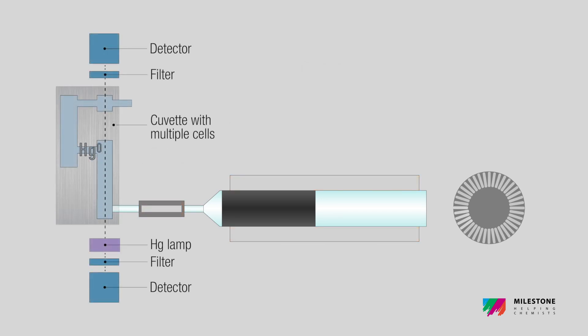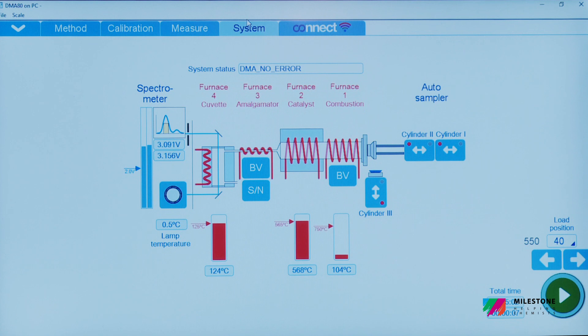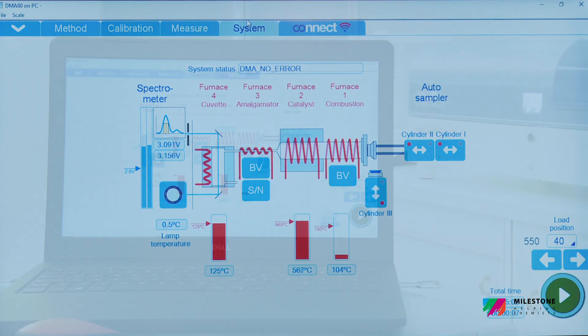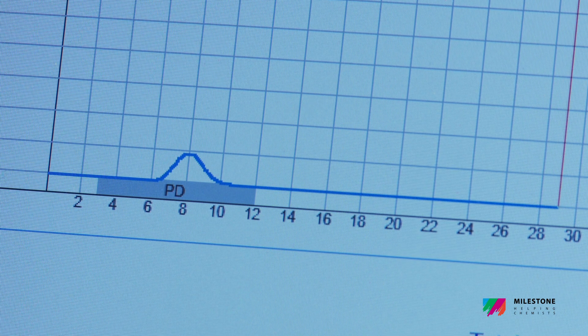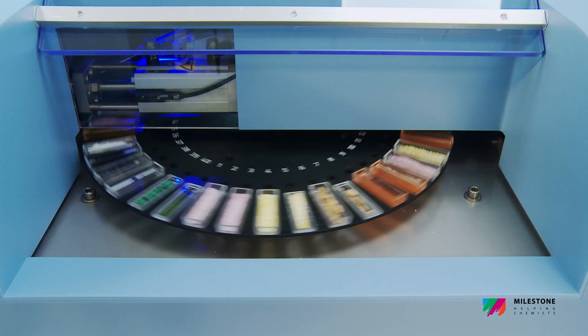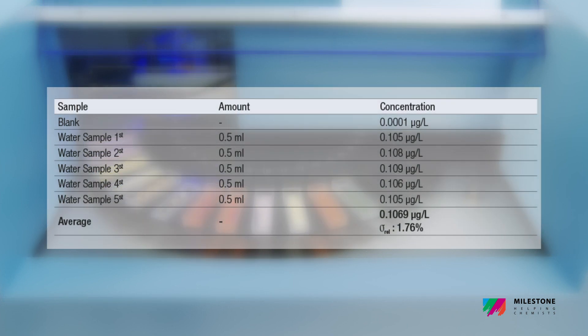Then released into multiple measuring cells positioned along the optical path of the spectrophotometer. The double beam technology dramatically reduces the signal-to-noise ratio, improving the quantification limit, accuracy and precision, ensuring superior reproducibility, reliability of the results and greater performances, even at PPT levels.